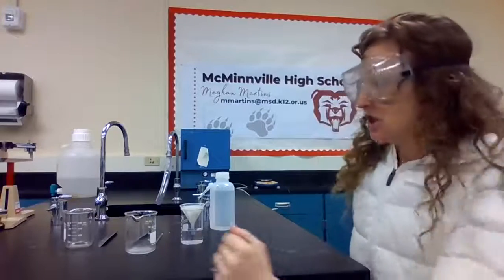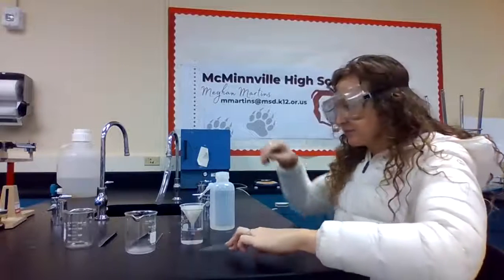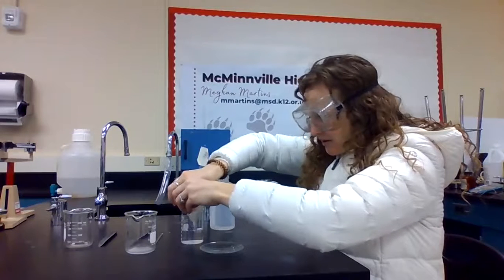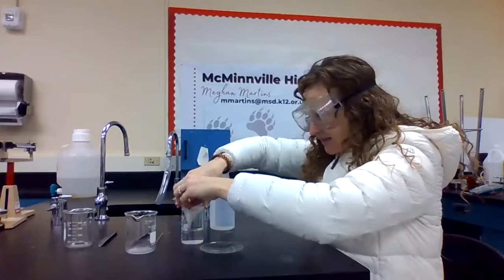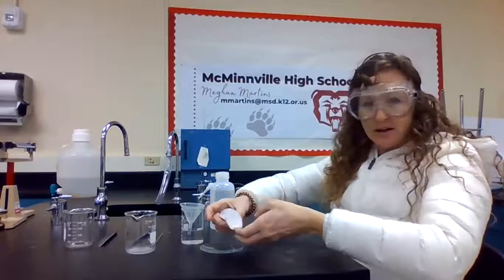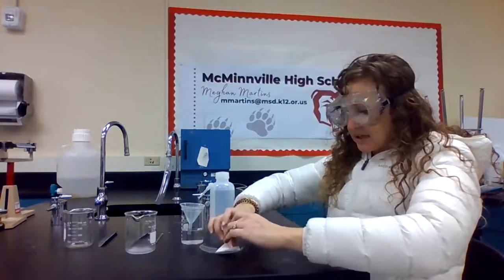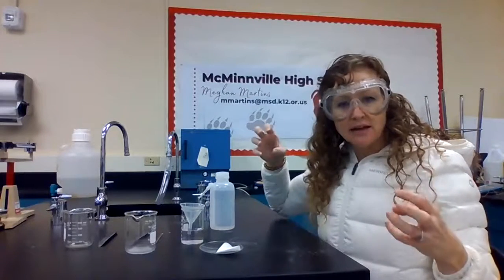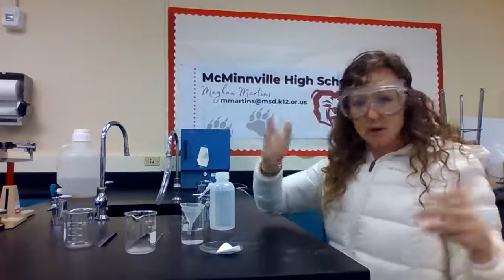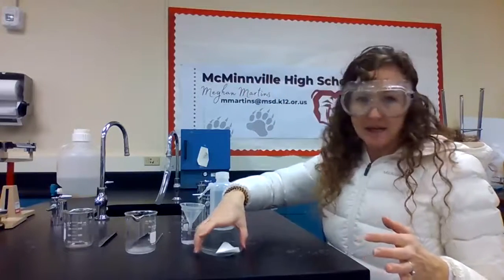If we don't have that much time, we're going to use a watch glass and a drying oven. So when you pull your sample out, you've got to be really careful. You don't want to rip the filter paper. We don't want to lose mass in our solid or our filter paper. Okay, so we're going to pull it out. And then if you keep it folded like this, as it dries, it'll actually protect the solid in here, because as that solid dries, it's going to turn into powder. And every time you move it or the breeze blows, powder is just going to go poof everywhere. So if you close it and lay it on your watch glass like that, it'll kind of protect the powder.